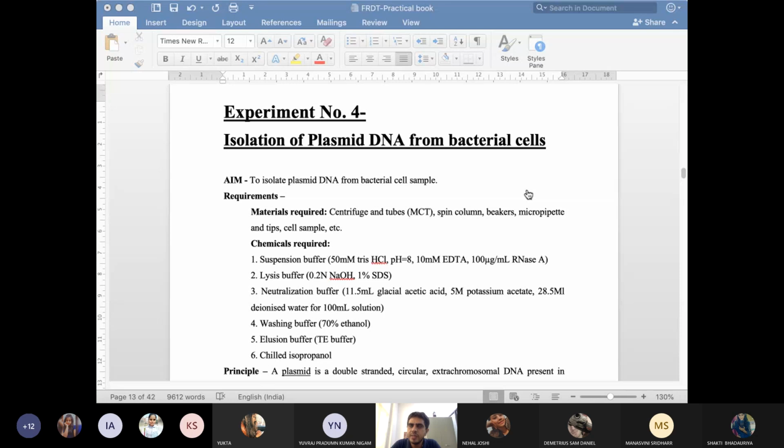And this basicity is because of what? This basic pH is because of what? Can you give any example of any base? Yes, NaOH. So in NaOH, this basic nature is because of sodium ion or hydroxide ion. Hydroxide ion, OH.